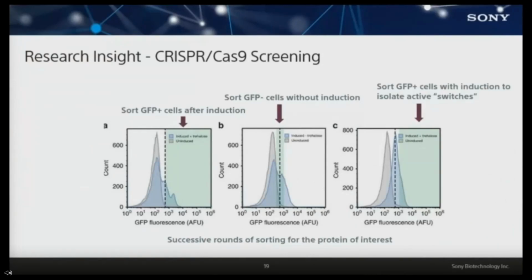As with a lot of sorting projects or assays, a lot of times there's multiple sort steps, such as in the case of the CRISPR-Cas9.